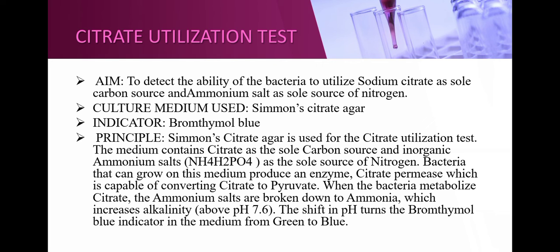In this process of citrate utilization, when the bacteria increase the pH of the medium, the bromothymol blue, which is naturally green, changes. When the pH increases above 7.6, the bromothymol blue indicator turns from green to blue.